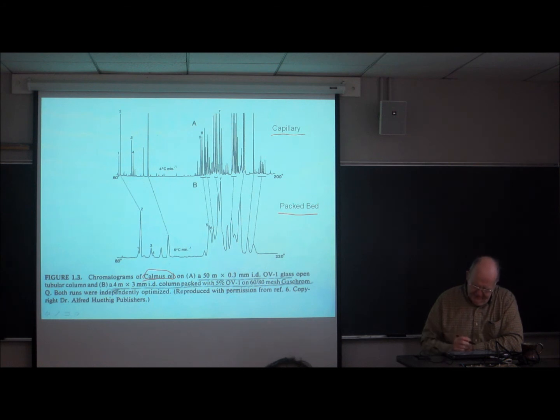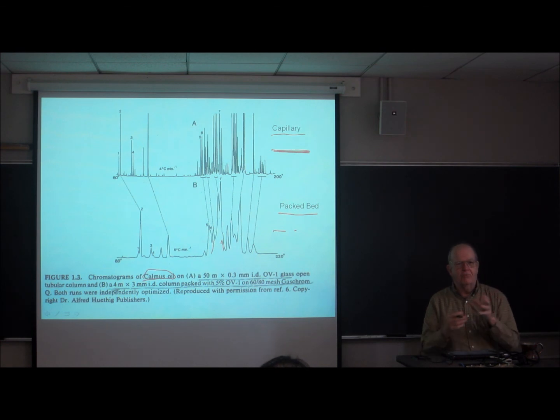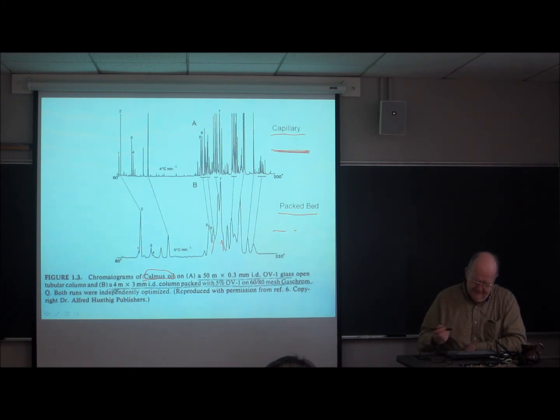But even though the stationary phase is the same and the sample is the same, you can see way, way, way more peaks up here than you can see here. I mean, this thing here is probably a collection of maybe 10 or 15 peaks. So it's not 2 peaks, it's a whole bunch of compounds that just don't separate well enough, with peaks narrow enough so that you can actually see the spikes. Again, a clear demonstration of the vastly improved resolution available in a capillary system versus a packed bed.